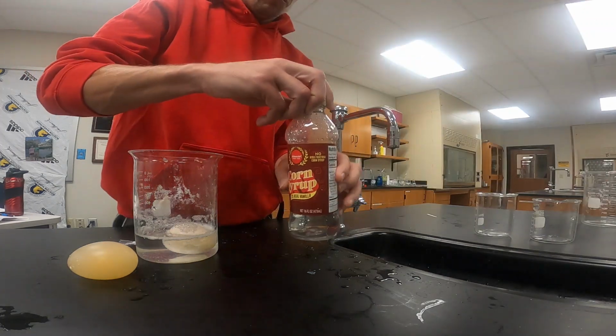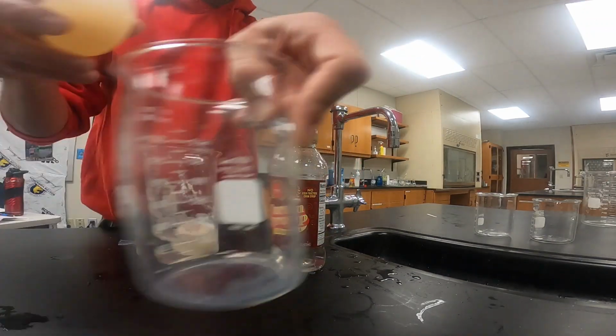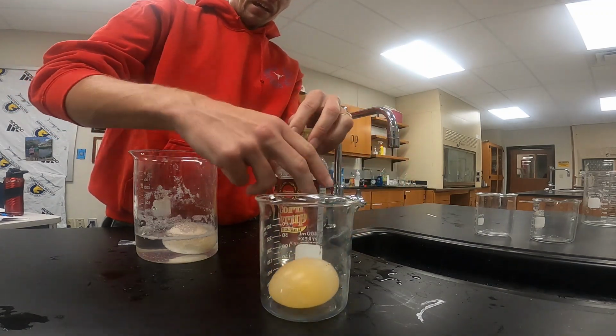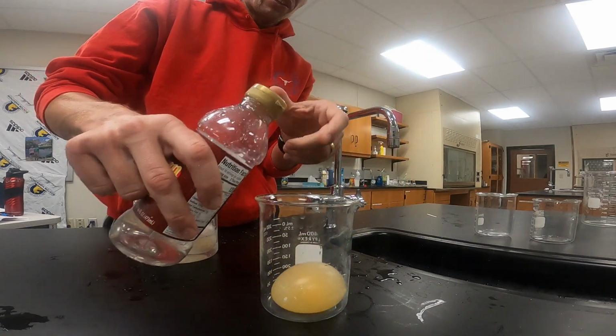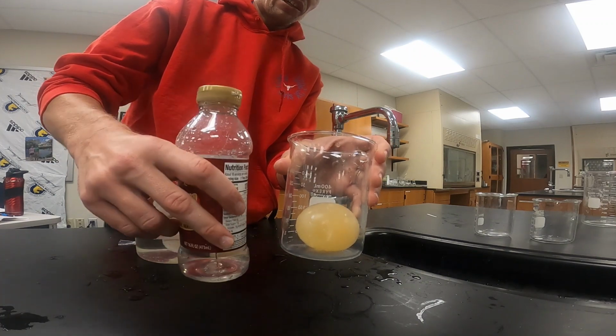Then for egg number 2, we're going to use corn syrup and repeat that same process. So I'm going to put the egg in a beaker, add in my corn syrup, and again we'll check in 24 hours. We'll show you our final product and check in with you in 24 hours.